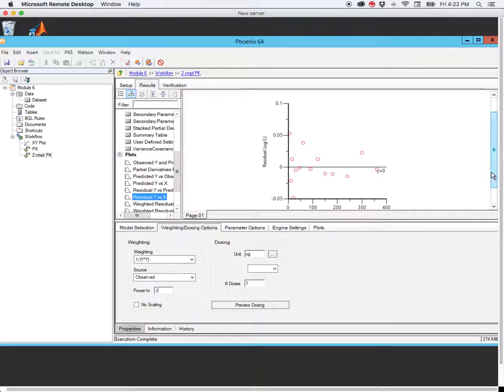That's just a quick introduction into how to fit a data set to a PK model using WinNonLin. This is a very nice, clean, ideal data set that I used for this demonstration, and you will have a similar kind of data set to use for your assignment. Thank you very much.